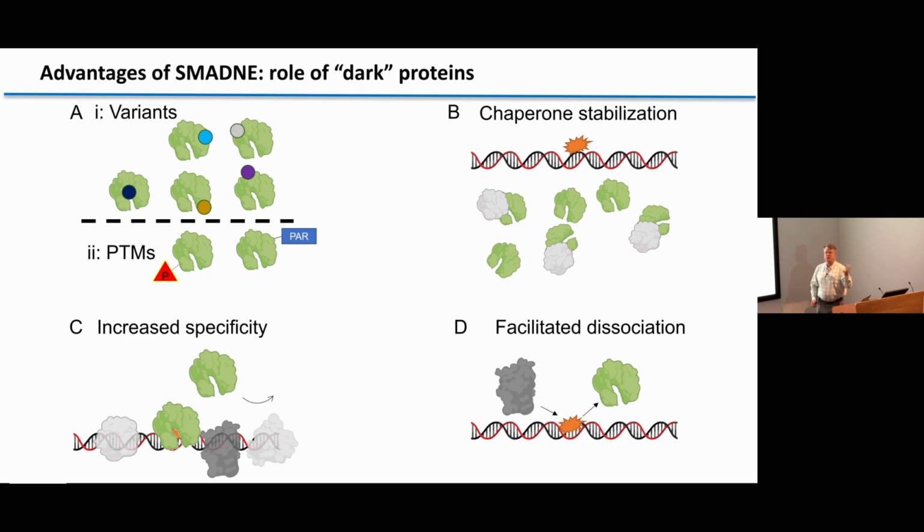So by overexpressing a kinase or whatever modifies your protein of interest, the chaperones were an added bonus. What we're finding, and this is very interesting, for some glycosylases, particularly 8-oxoguanine glycosylase, if you put that in the flow cell with undamaged lambda DNA, it binds non-specifically.